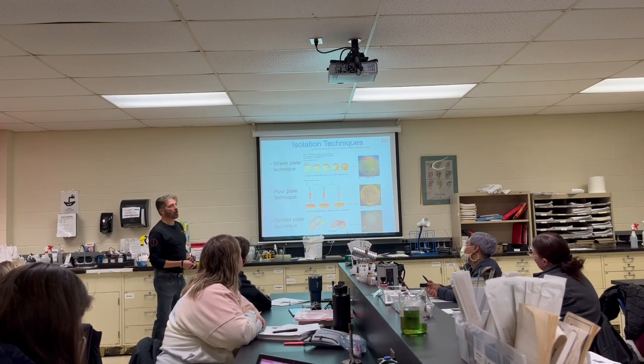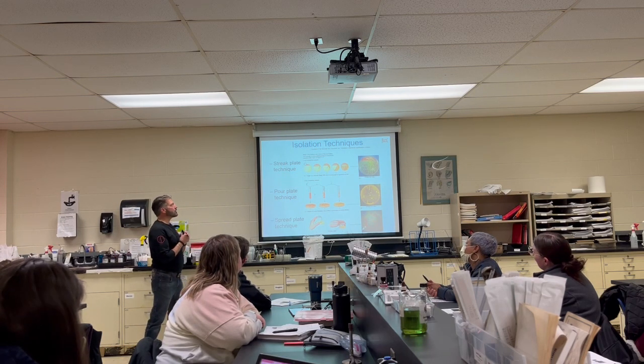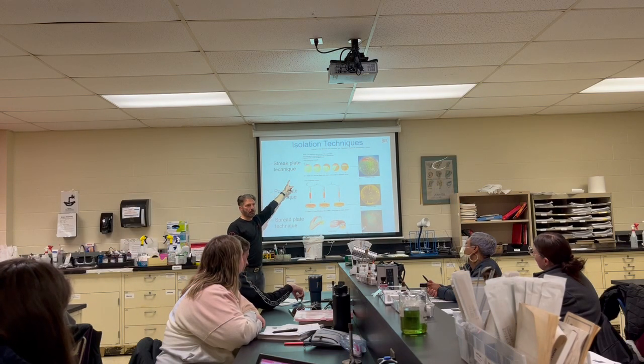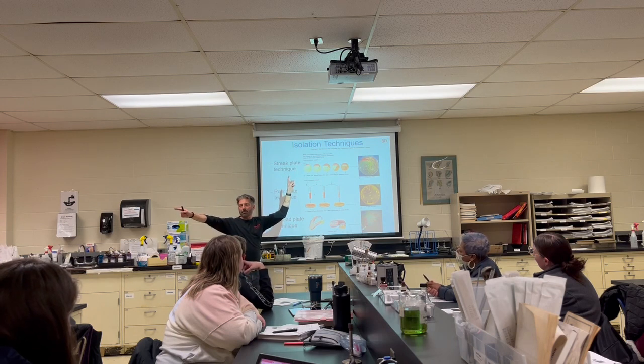Okay, so this here is a streak plate. We're basically streaking something, and we're doing what's called a serial dilution. I'm going to move the camera onto the board and go over it real quick so you have an idea of what we're doing.